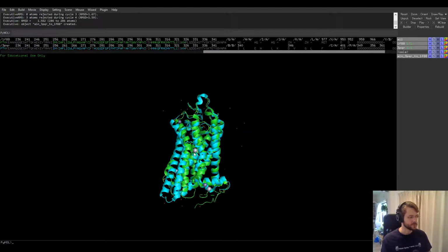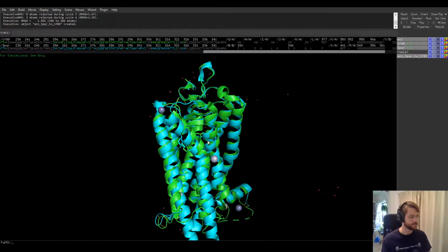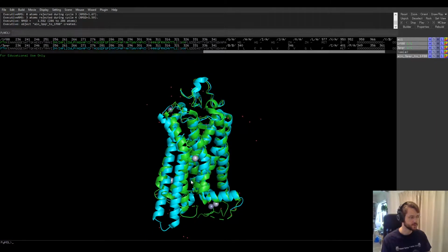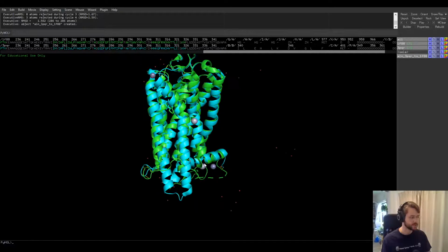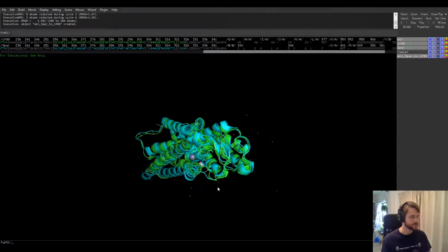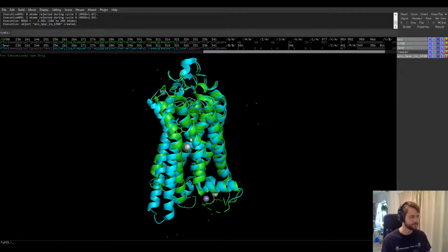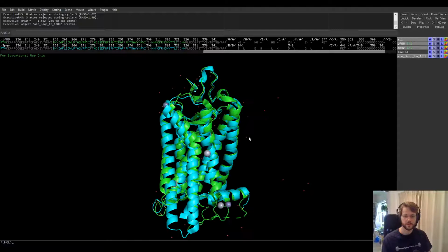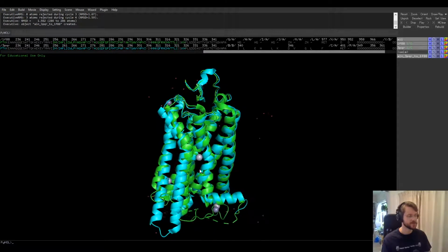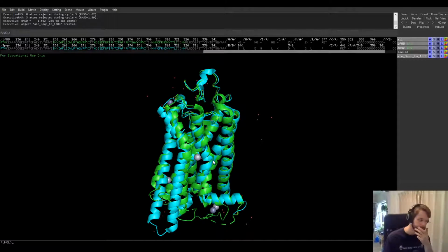All right, so now we want to look at it a little bit closer. So we see there is an N-terminal part that's sticking out on the outside. We have something on the bottom that's extra and loosely arranged. And we see that there's also a lot of conformational change going on in these alpha helices. So we've been looking a lot at proteins, and most of the function and conformational change comes from the properties of amino acids, right? So the change in how these amino acids associate with each other leads to then, for instance, like drifting apart, coming closer together, and so on.